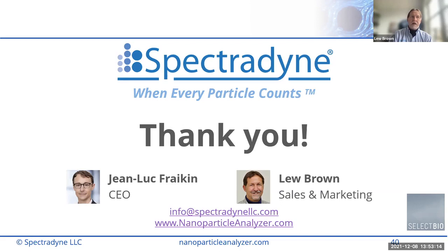And where that can get you into trouble is I've actually done some work with cylindrical shaped viruses that are about 50 nanometers in diameter, and the length might be close to 200 nanometers. And you can imagine that when you illuminate that with a laser for an optical measurement, either DLS or NTA, you're going to get different answers depending on the orientation of that particle, right?